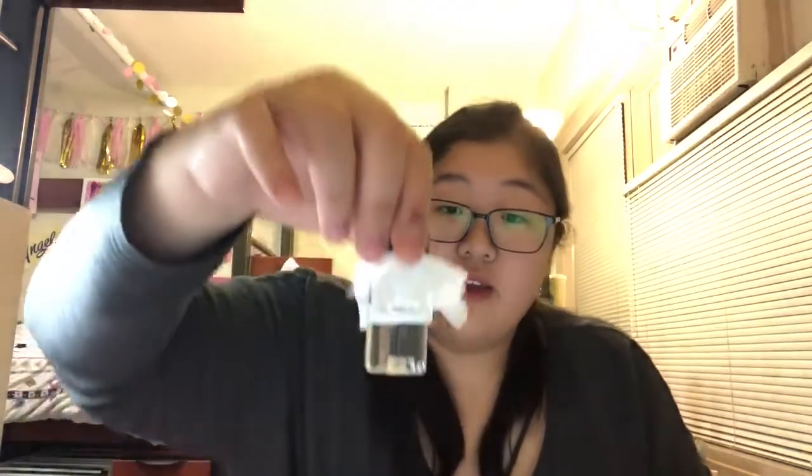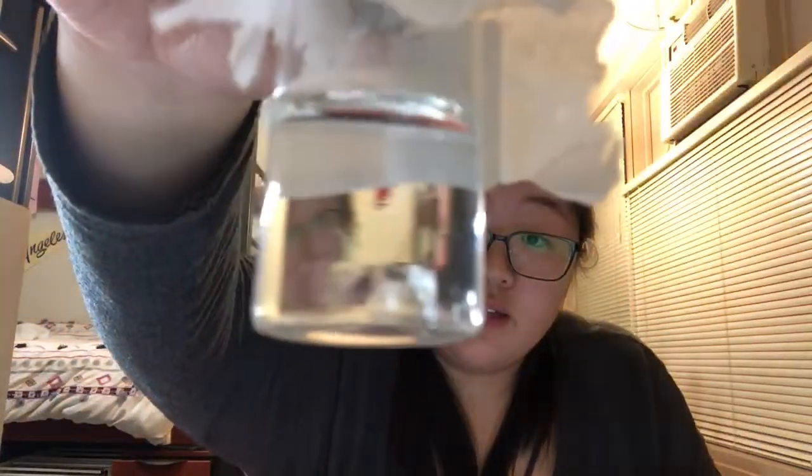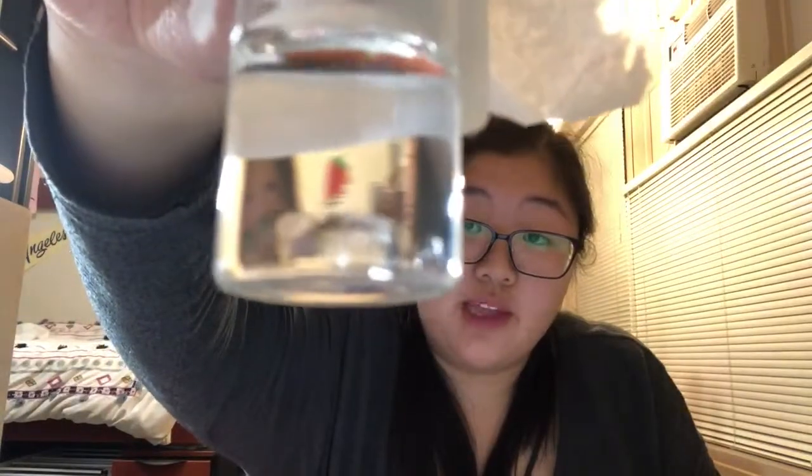Hi, this is an update on my alum crystal's growth. Since the last video, my crystal has grown dramatically. Last time it was observed that there was no crystal growth in the solution. However, this week it can be observed that there is a large crystal growth at the bottom of the vial. This is a very dramatic change from last week.